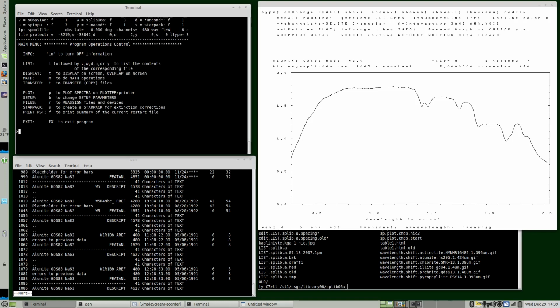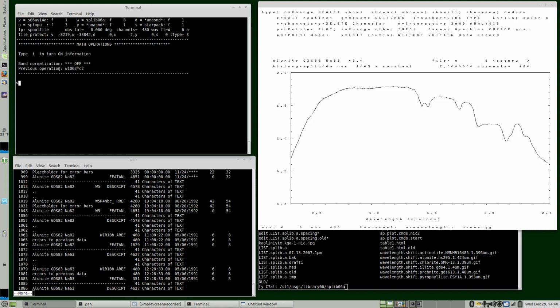So with that, that's a first introduction. You can list spectra. You have other tools to list spectra. You can plot spectra, and then we'll get into Tetracorder. We'll actually use the new feature where we can enter a Tetracorder set of features and see how they are being applied to an individual spectrum. And so that's a first order introduction. Let's do one other thing, and the default is the information is not turned on.